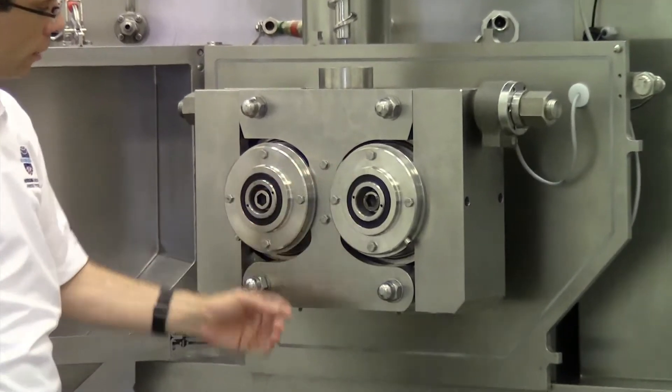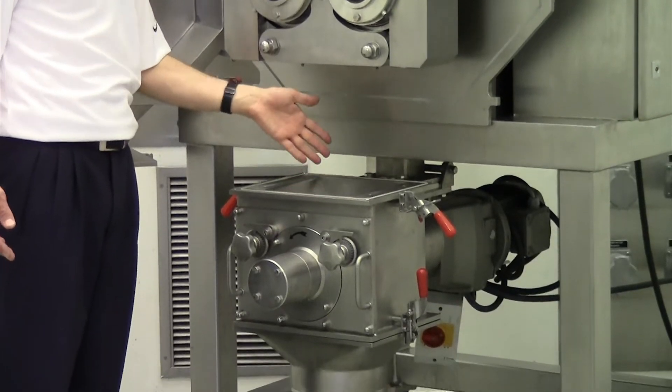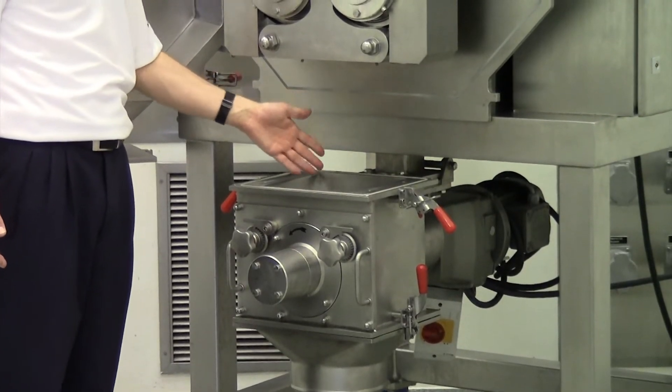Here are both rollers for compaction, scrapers underneath the rolls, and also the flake crusher for crushing down the flakes to granules.